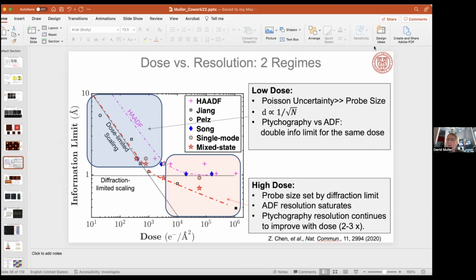I think for us, there's a lot of information in the central disk. So we've sometimes done just the central disk to see what you get there, and then we've grabbed the other beams. There are some other systems where you do Bragg ptychography, for instance, for other reasons, like producing a strain map in a material. We'd like to do some Bragg ptychography with our setup, and there we don't need the central beam anymore. Maybe we're spoiled with our detectors. I don't have to mask anything out right now. I grab everything and use everything because I want to take advantage of every electron. But if there are reasons to speed up a reconstruction, then maybe we could get a first guess with just the low frequencies and get that stabilized first.